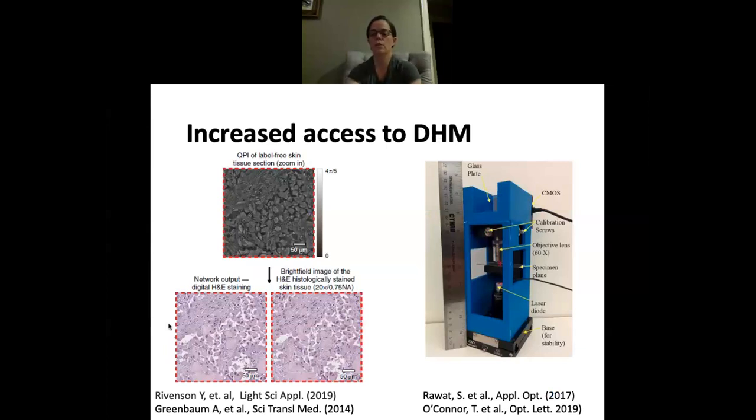Continuing research in the field of quantitative phase imaging using DHM has also explored the possibility of improving resolution while sacrificing less in acquisition speed by applying structured illumination methods to DHM rather than tomography.